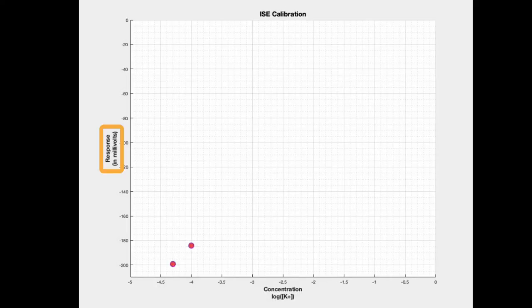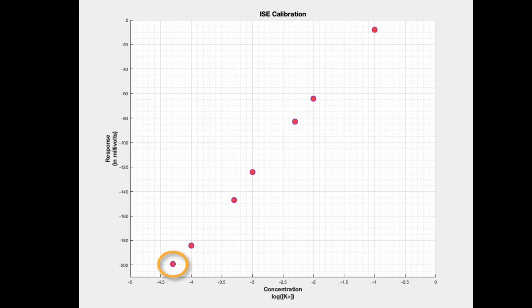By plotting the potential of the standard solutions as a function of the log of their concentration, we can construct a calibration curve. The first standard measured should always be the lowest concentration, then move on to the next most dilute solution with each subsequent measurement.